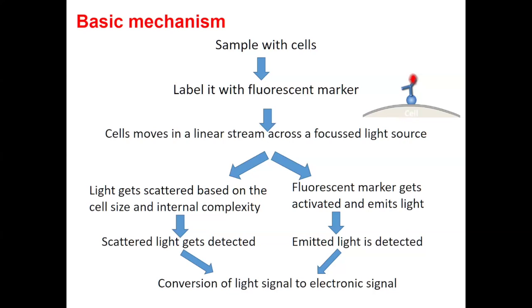Let it be a lymphocyte, not only as B lymphocytes and T lymphocytes. You can further characterize T lymphocytes as helper T cells, cytotoxic T cells. Further characterize helper T cells into naive, central memory, effector memory, terminally differentiated, T regulatory cells, and whatnot. And you need this because your immune system is so diverse. You need such a technique to completely study it, right?